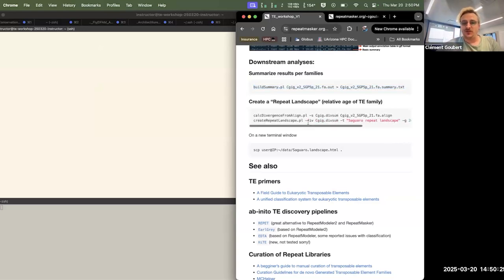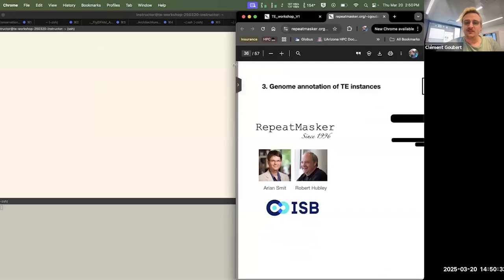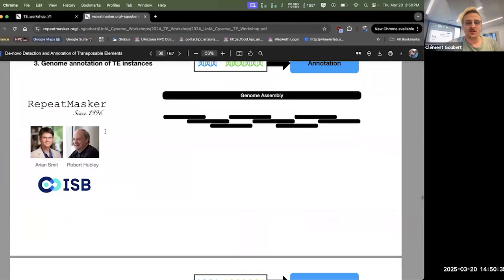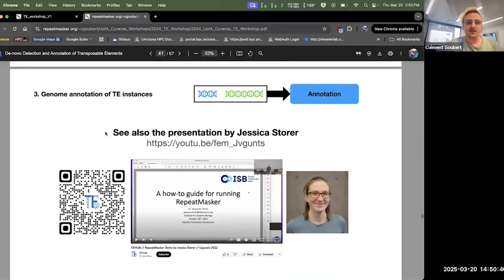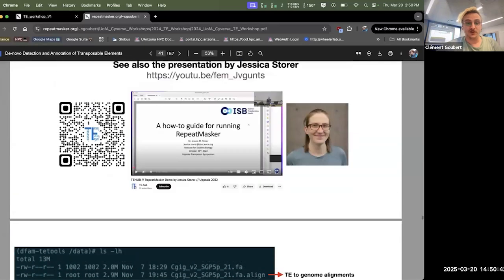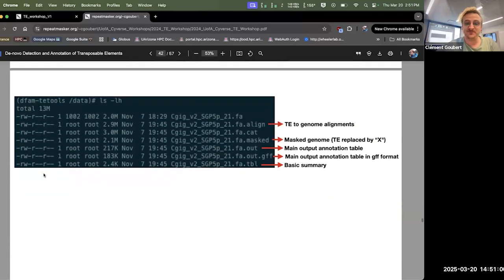Next, we have 10 minutes. I think it's enough to do a very cool analysis, and for that, I want to show you a little of what we have here. So let's skip the details about RepeatMasker, but if you have questions, feel free to ask me. There's also a more in-depth tutorial that you can access via this QR code. If you have the slides, you have the link. That's Jessica, who worked with the people at RepeatMasker for a while, and she can explain a lot of details and little insider tricks.